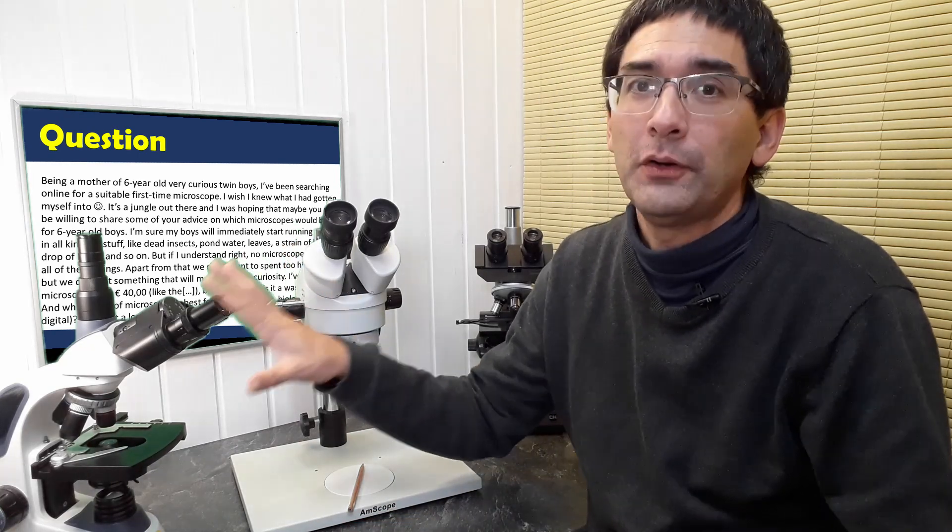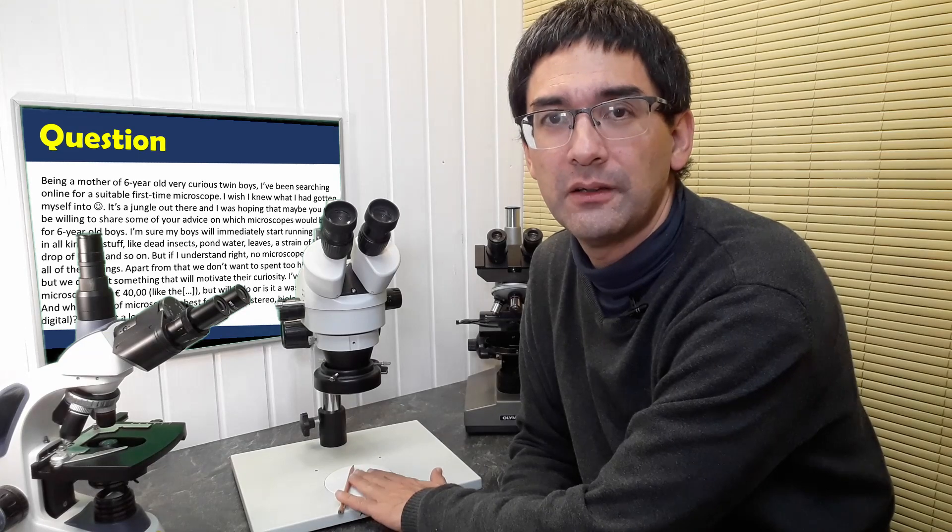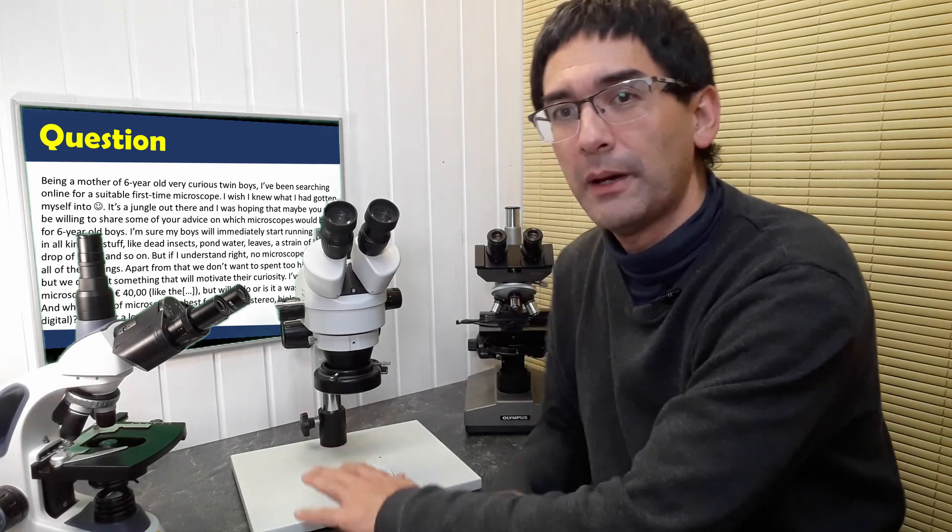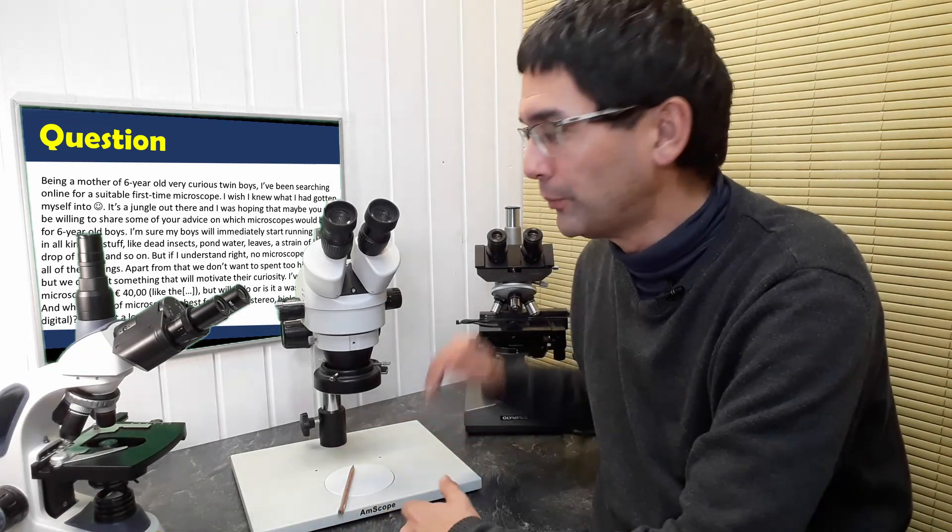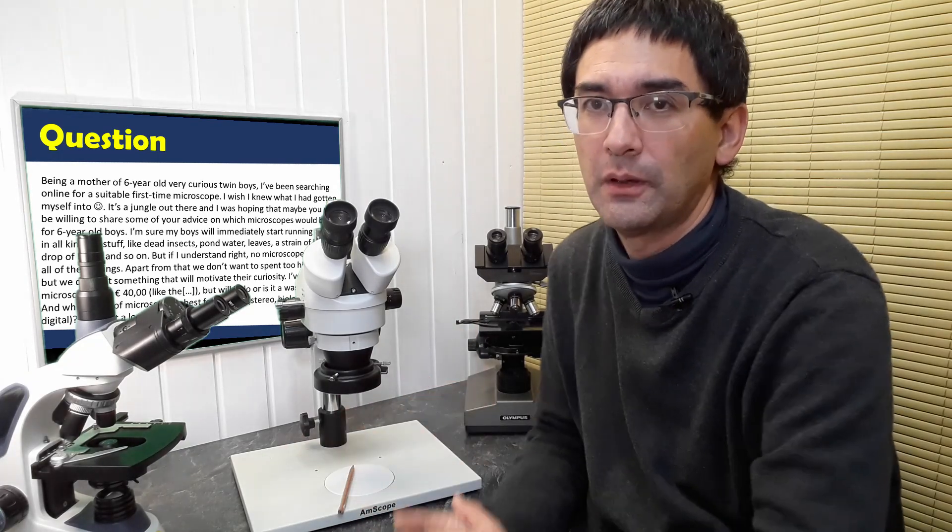And with those compound microscopes, like those over here, you need to work with the microscope slides. Of course, you can also put microscope slides here on this one. This one, by the way, does not have any light coming from the bottom, only from the top. But there are also stereo microscopes that have light from the bottom. It depends on what model you buy.